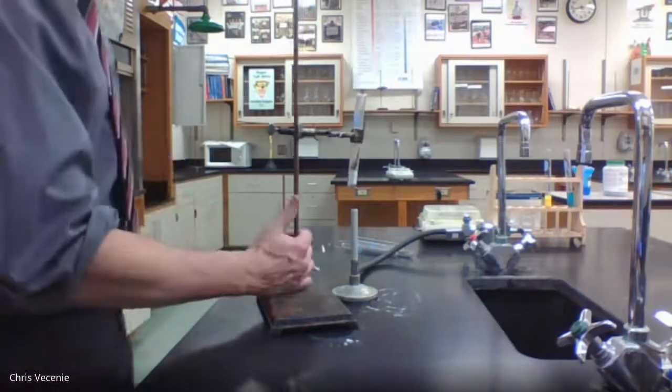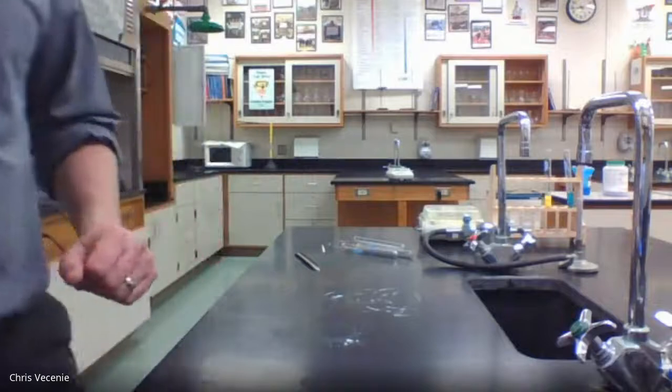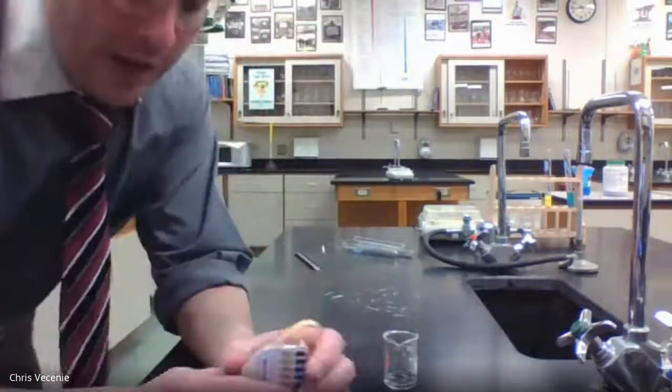All right, now that's going to be a little bit hot to tear down, so I'm just going to move them to the other side of the counter. All right, let that cool off, and we'll tear that down at the end of the experiment. All right, into experiment number 4. So in experiment number 4, we have to do a couple things.